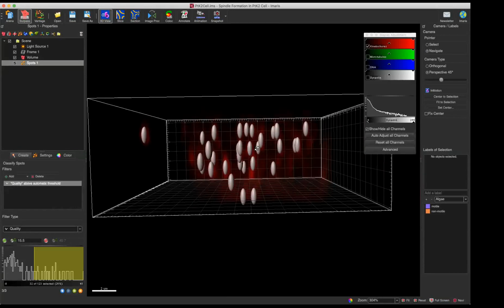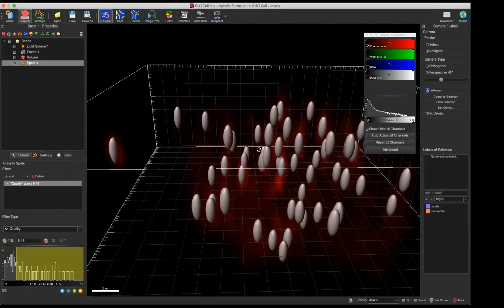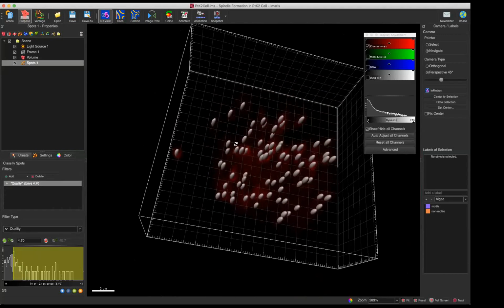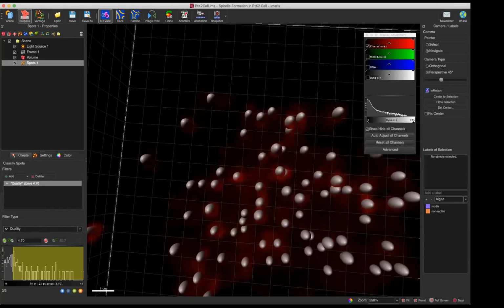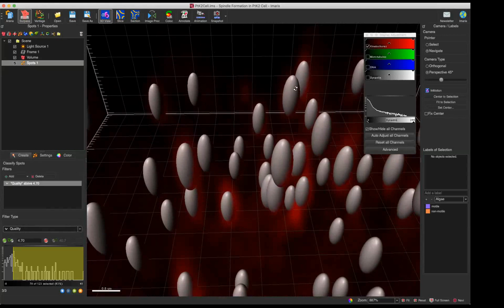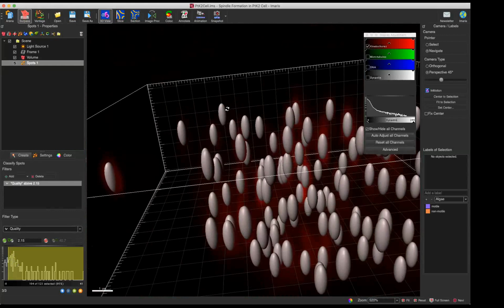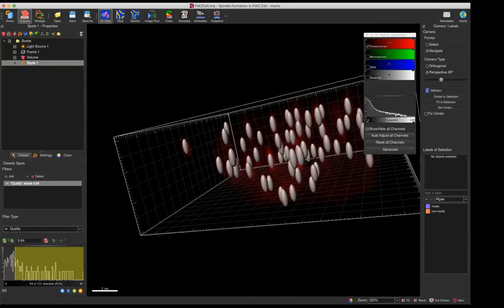The third step is to filter, to remove or increase the spot detection. You can think of it like sensitivity. To increase the sensitivity, Imaris will be able to detect more spots on the image, but there is a risk of also detecting the background. So it depends on the image, and you can optimize the threshold for your image like this. This is the quality filter, and quality is basically the center intensity. The quality calculation is based on the pixel intensity at the center of the spot. If I use a lower threshold, it is able to detect dimmer or low intensity spots, but sometimes that is background. So you may want to adjust this threshold properly.